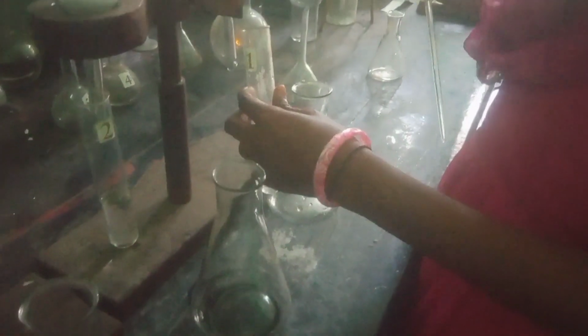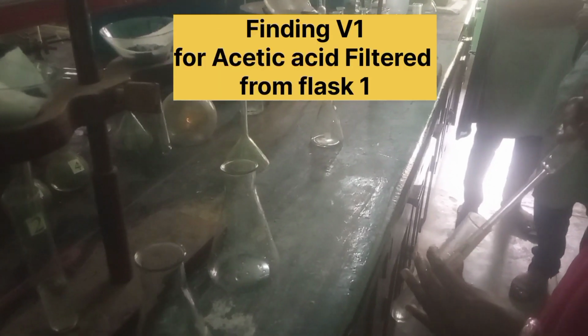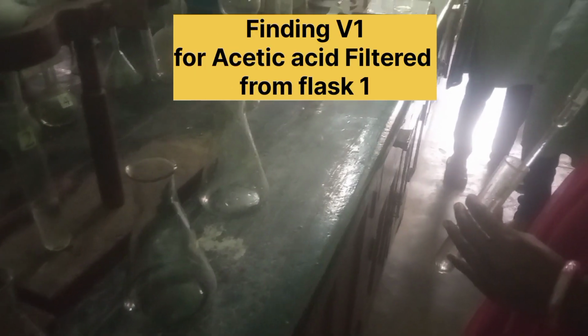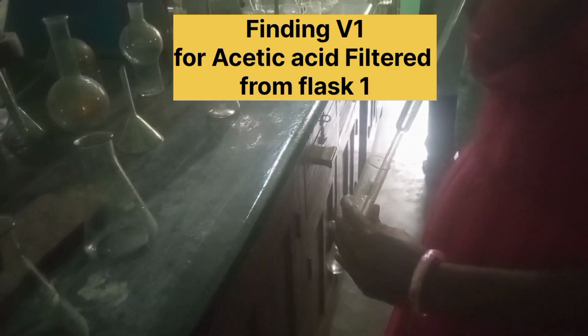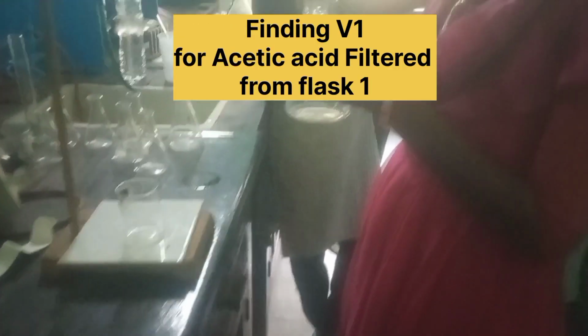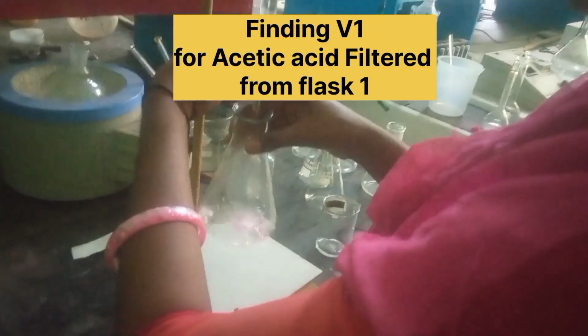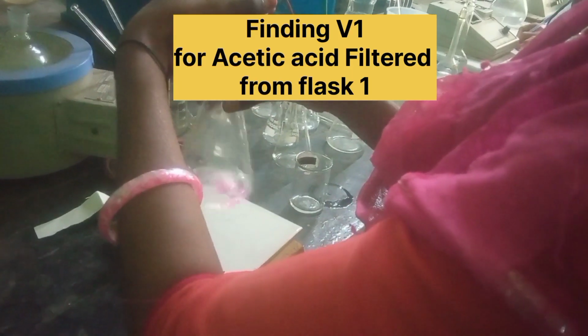Now another student has taken the acetic acid from boiling test tube 1, which was obtained by filtering the material in standard flask 1. So now she is taking 10 ml of acetic acid solution into the conical flask, and she has added indicator and is titrating now.